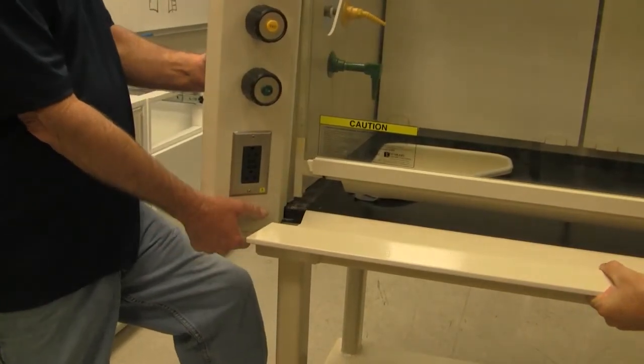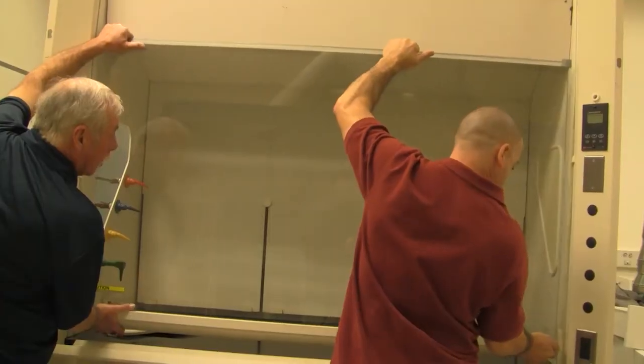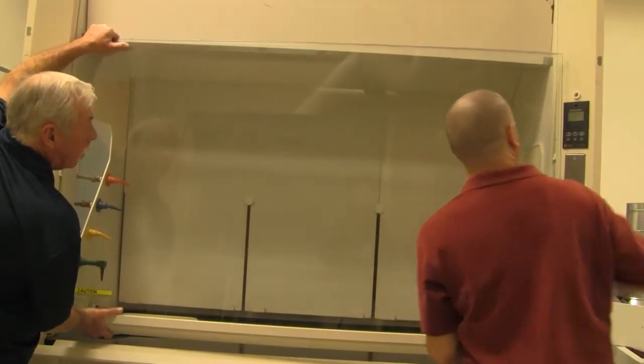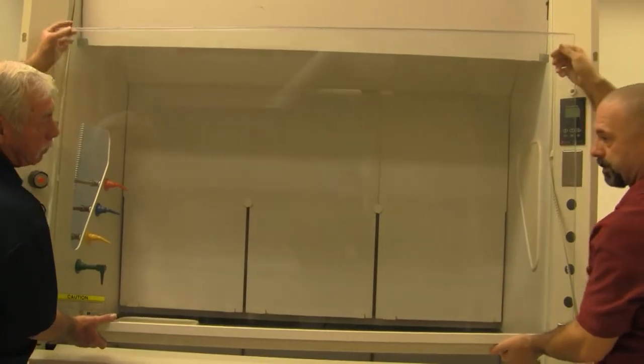If your hood is installed where you cannot spread the sides as shown, you must remove the sash by raising it above the hood to access the belt attachment points.